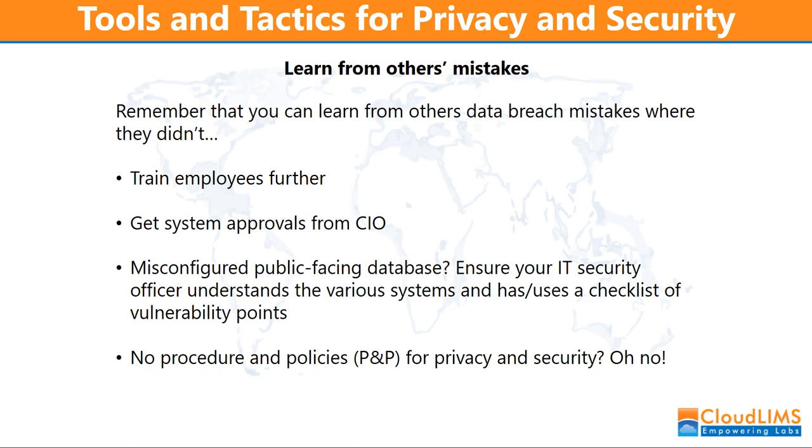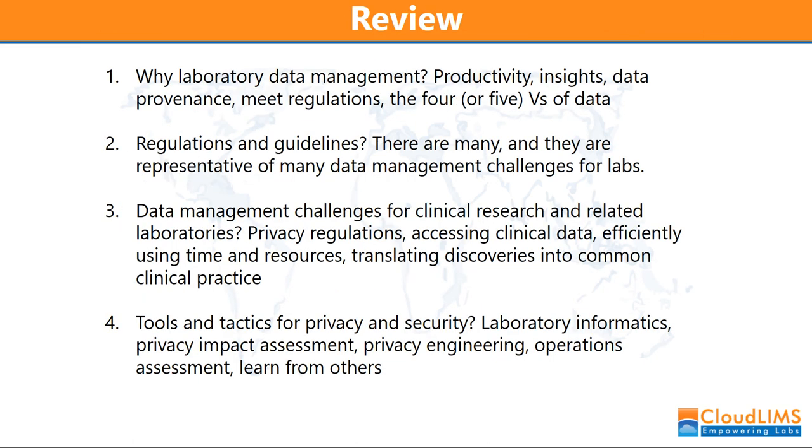So in this webinar, we covered why you need to focus on laboratory data management, to be more productive, to use data to gain insights, to manage data in a safe and productive way, to do it according to regulations, and to manage the 4 or 5 V's of data.